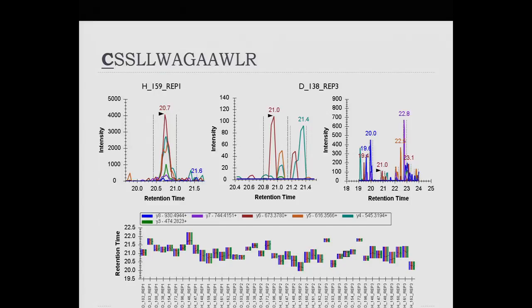If I zoom out to see the entire measured range, I could integrate the entire measured range here, and I wouldn't get as much signal as I'm getting over here. So I have to choose something over here, or I have to take on the theory that maybe I just didn't catch this peak in this retention time window. So maybe the peak is actually outside the retention time window because of some sort of retention time shift. Those are the two possible hypotheses.